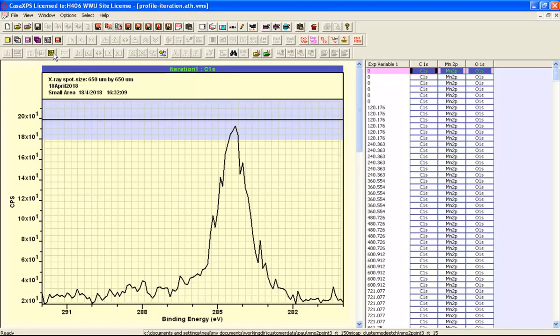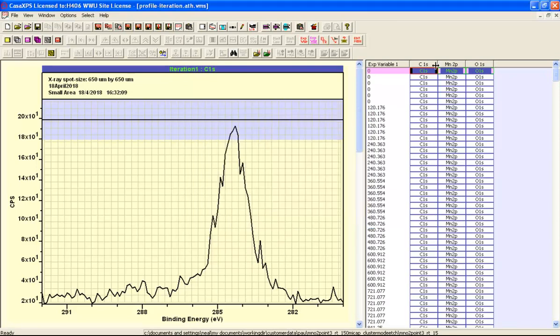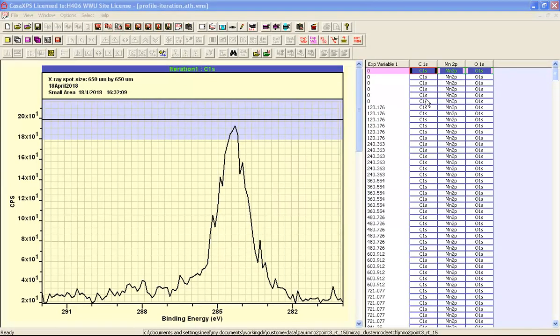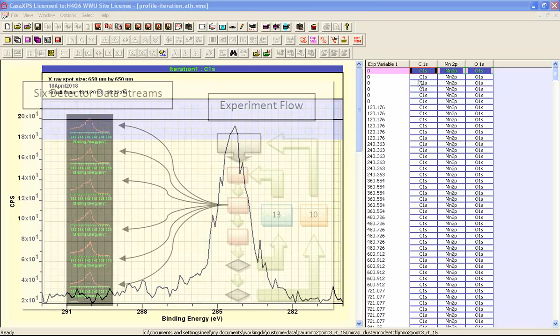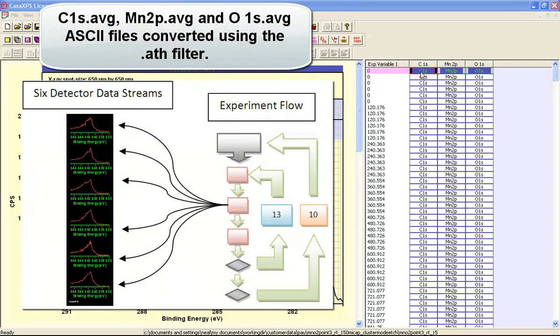You can see the new VAMAS file within the existing directory. This was created from these AVG files and then opened in CasaXPS. And these data are now organized so that we can see the structure of the experiment. So we have the six detector channels here.